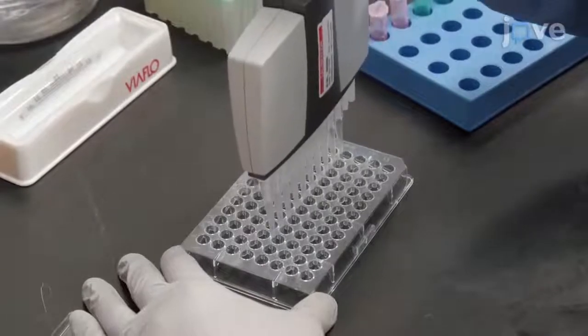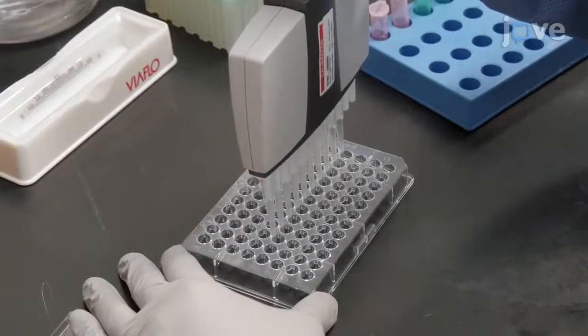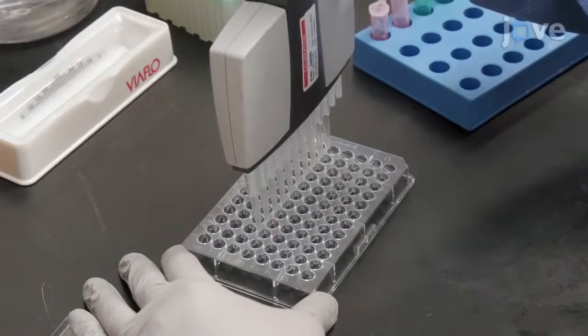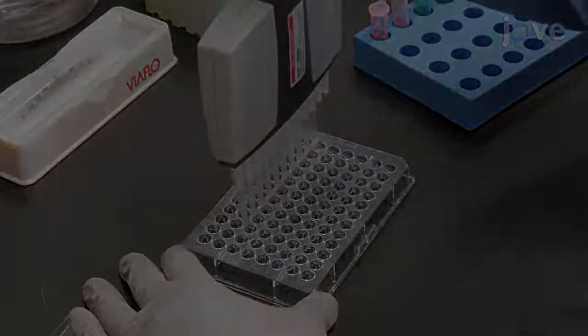Continue this serial dilution process through row A. After mixing the wells in row A, remove and discard 10 µL from wells 3A through 12A so that the final volume in all wells is 20 µL.